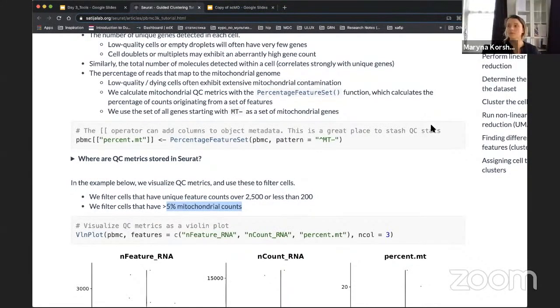Yeah, when I was working with brain organoids data, I used a cutoff of no less than 20%. Because organoids by themselves are quite heterogeneous, I looked into this variability and distribution of mitochondrial genes to understand which cells are definitely outliers and which might not be such bad or non-informative cells. But if you have a perfectly set up experiment for PBMCs, you will use definitely less than 10%. So less than 10% for PBMCs.